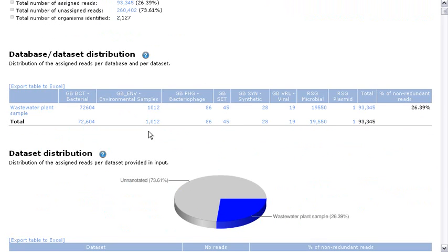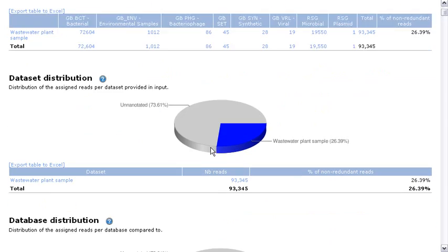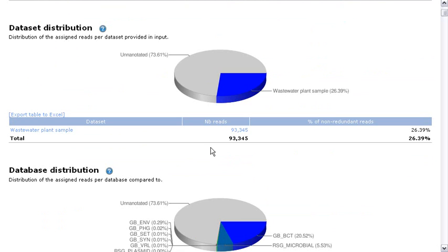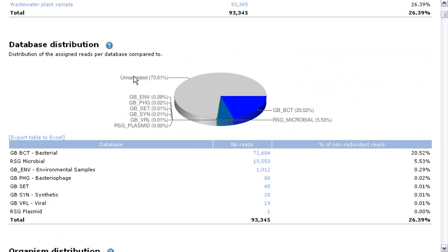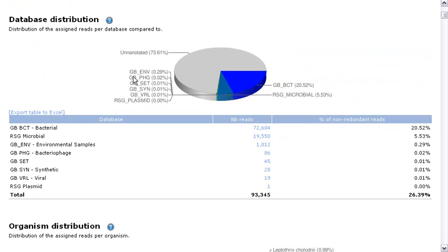And if I keep scrolling down, you will see some statistics about the split up by data sets, the reads annotated by GenBank bacterial, environmental, etc. And then we keep scrolling down and we see the split up by data sets. Here if we had several data sets, we would have multiple lines and the database distribution, how many reads annotated by each division.